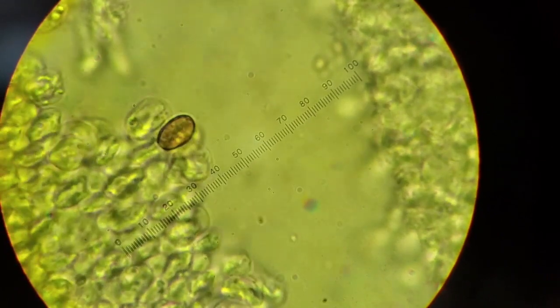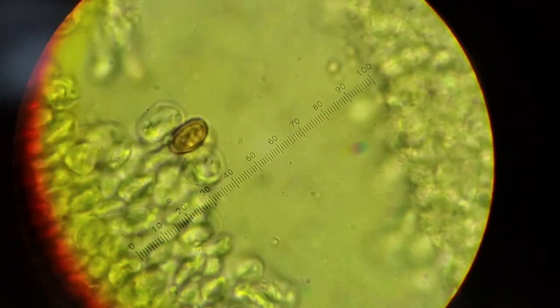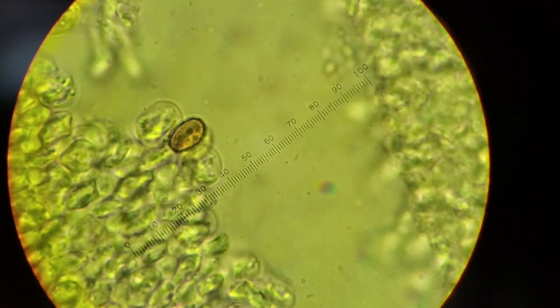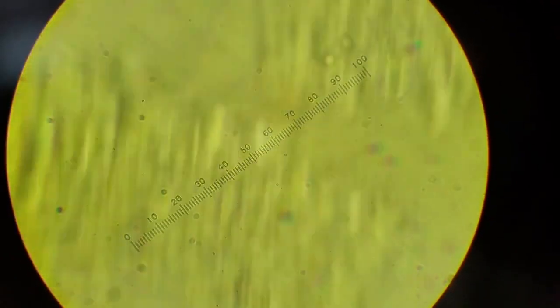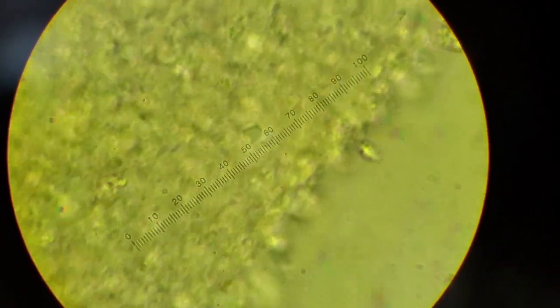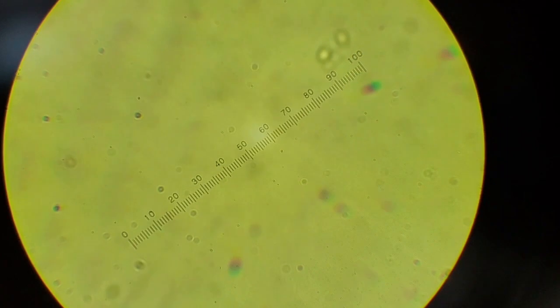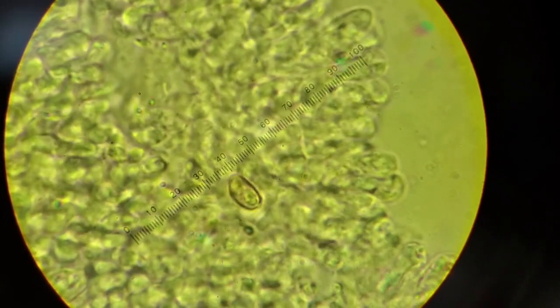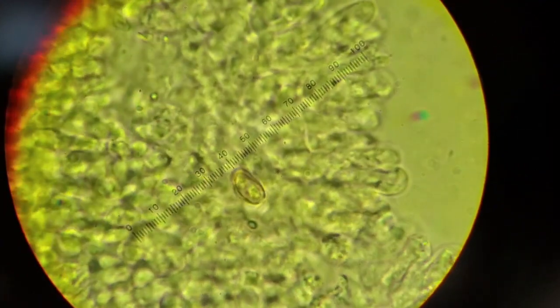But with spore measurements, what we're trying to look for is the adaxial flattening. We're looking for the base, the apex, and trying to make sure that you have a complete view. So luckily the spores in this specimen are easy to see because they're pigmented. As you can see, there's not that many in this mount. I'm going to come back and see if I can find one. See, this one's an interesting one. This is an example of a spore that's not quite ready for measuring.